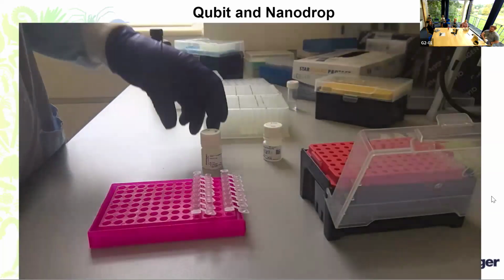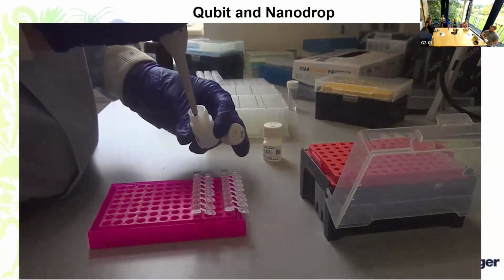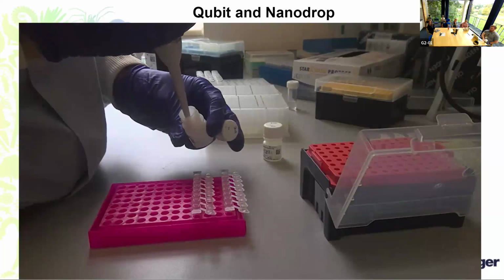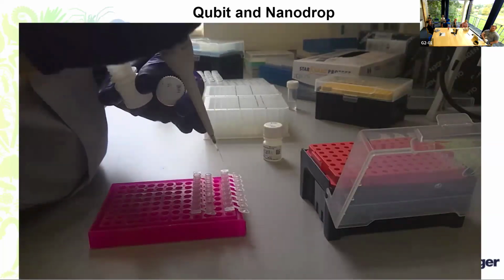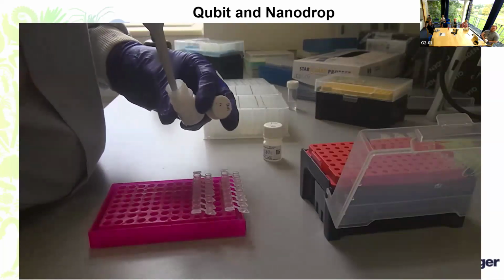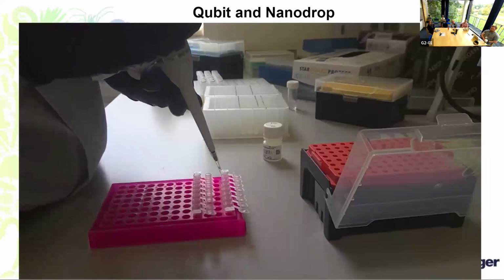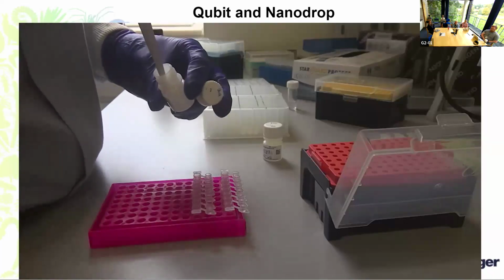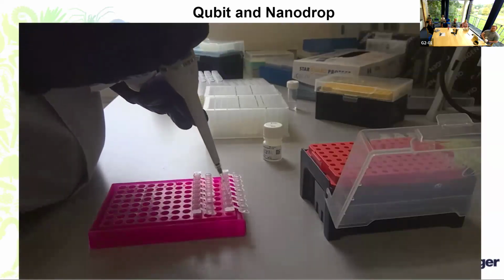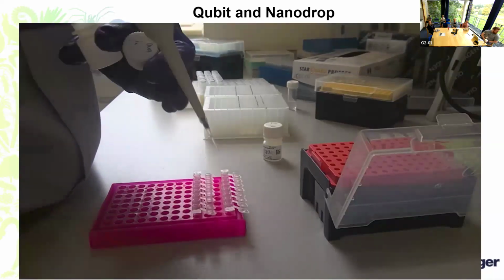So firstly, starting off with the Qubit, we add in our standards. So we have standard 1 and standard 2. The Qubit we have in the lab is a strip Qubit, so we can do 8 samples at a time. And that means we have to put in DNA standards for each of the 8 wells that we have in the Qubit machine. So here I'm adding 10 microliters of standard 1, followed by 10 microliters of standard 2.